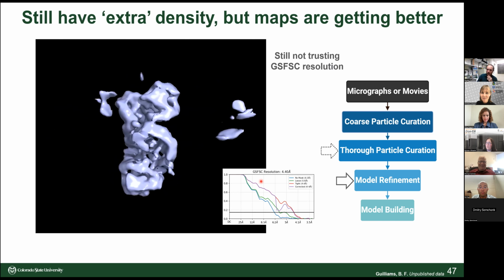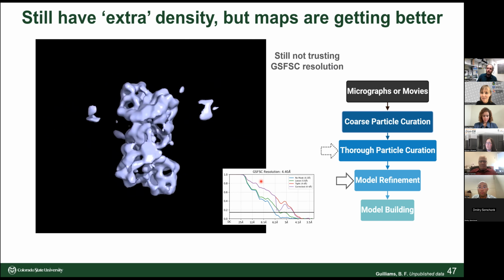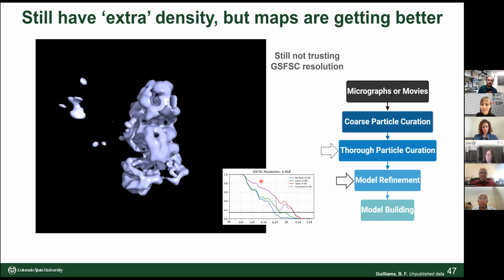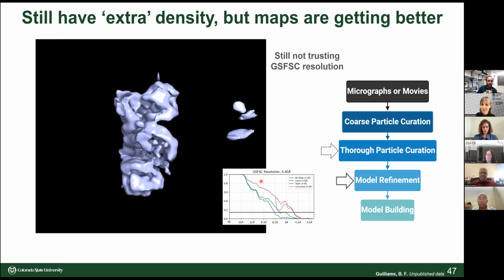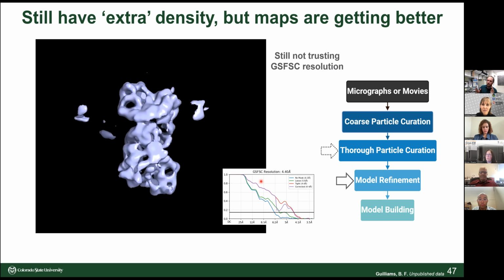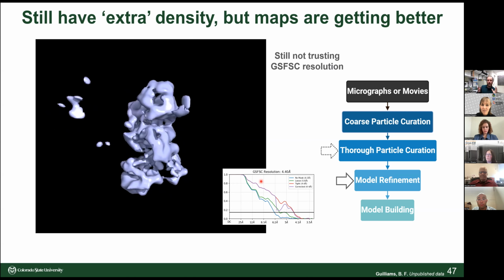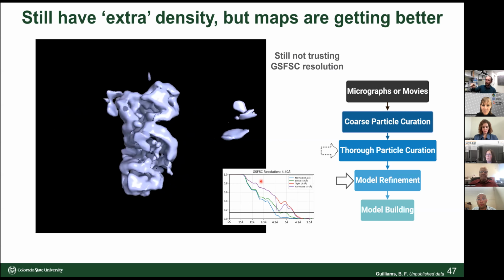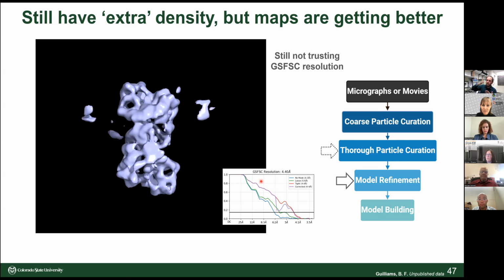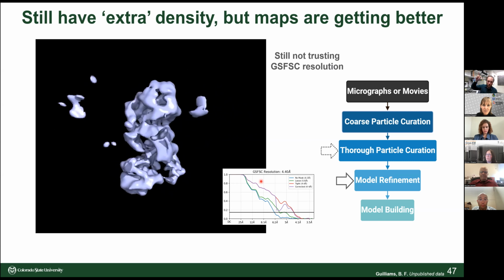And I guess your point about preferred orientation, there's definitely some of the views of this protein that are much easier to pick and identify in the micrographs as being real. So I've been trying to be careful in leaving in a lot of the junk, because if we're looking at this along its long axis, it's maybe 70 or 80 angstroms from tip to tip.